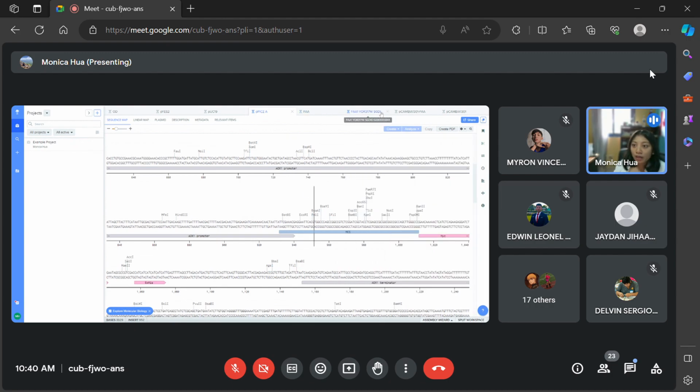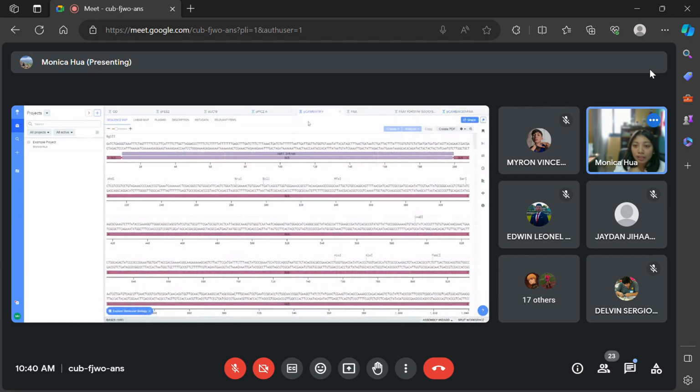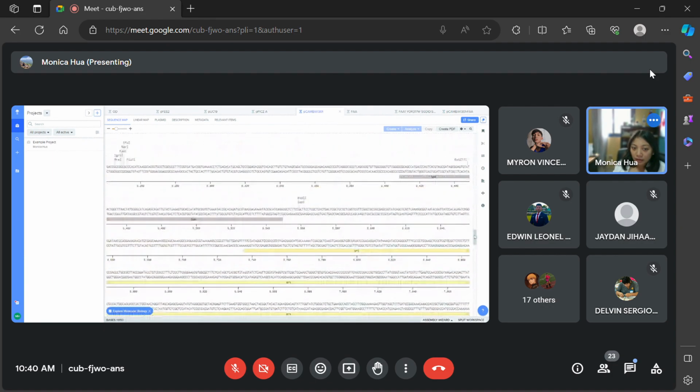And then for pCambia, this one is a bit tricky, all right? For pCambia, let's see.